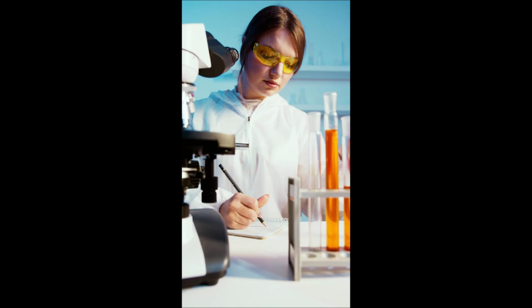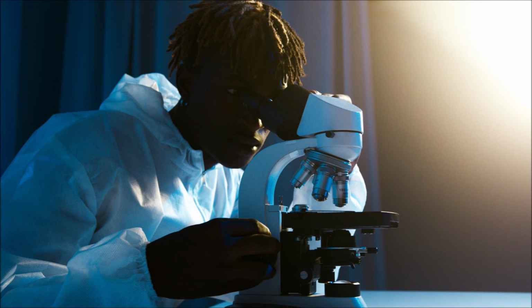Also part of the preparation when you want to collect the sample, you have to have a notebook for the field notes, and a pen and marker for labeling after the collection of the sample.